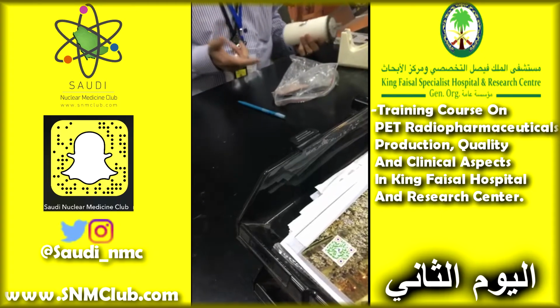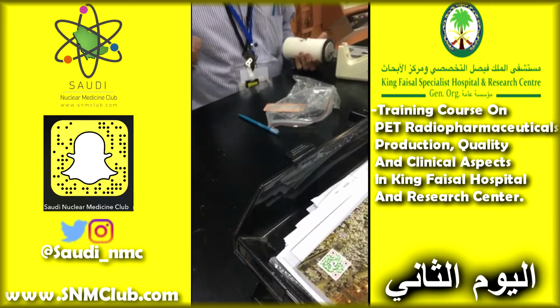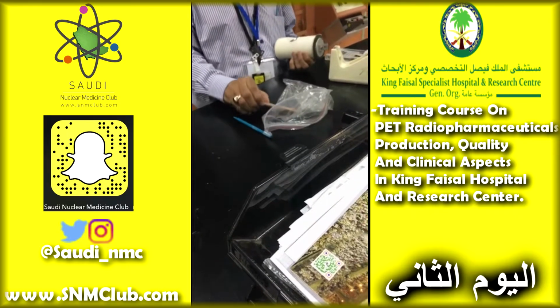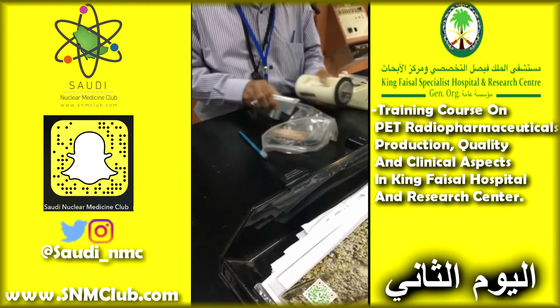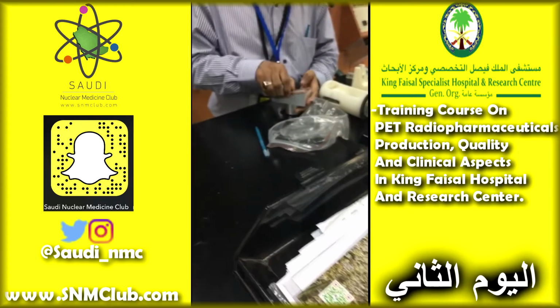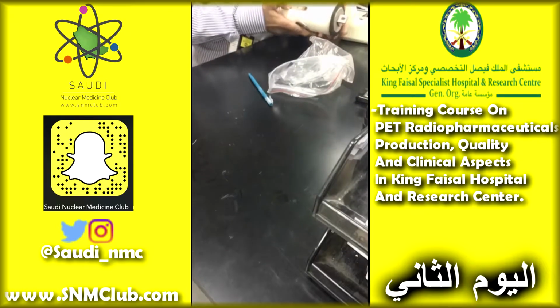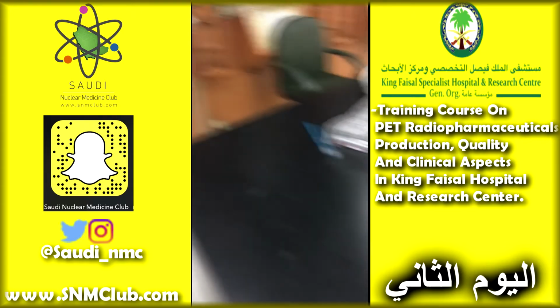And you do the electroplating. You get a set of 6 or 4 or whatever plates at one batch. So this is less than a milligram loaded on it. You're going to screw it on this target holder through the carrier in a pneumatic tube.